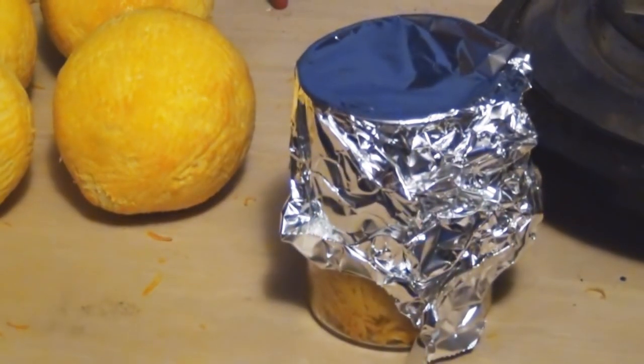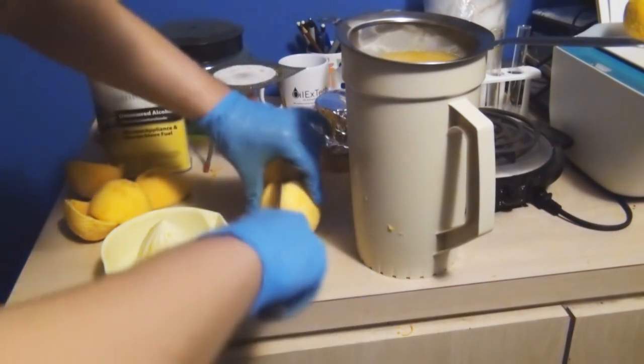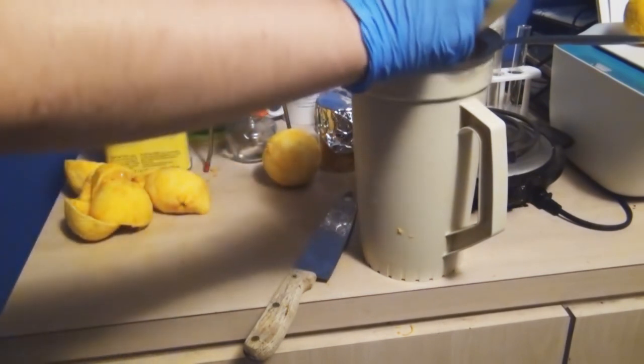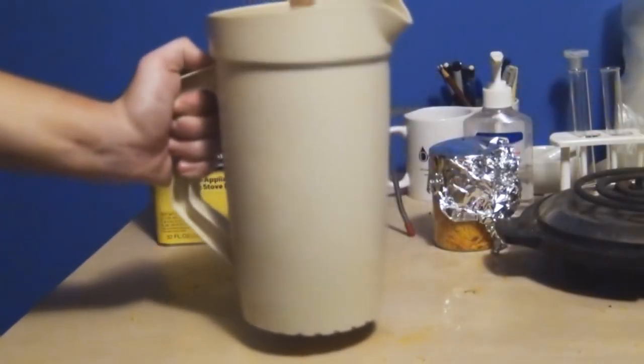For anyone in the comments going to say something about me wasting the oranges — I did make orange juice from them, and boy was it good. Store bought orange juice definitely can't compare to this. Now that we've made sure nothing has gone to waste, the next step is to set up our distillation apparatus.